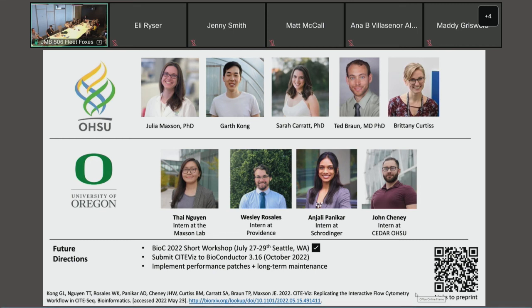I think maybe one hiccup would be that the shape of the UMAP would be different. But you can learn a UMAP and then project new data into it. Yeah, that doesn't have to be a showstopper. Right, so that would be the workaround. But that's a good feature to include as well, because we rarely do things with just one experiment and done. It's always going to be a series of experiments, and improving the reproducibility and the parameters of that would be good.